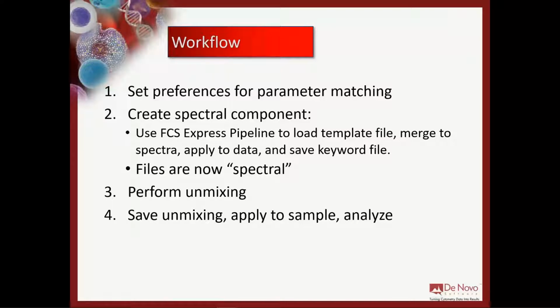Now, in FCS Express, what's the workflow? How do we actually set this up? What we've done in the latest release of FCS Express 7 is make this very easy to do, and that's what we're going to go over today. So one of the first considerations is setting preferences for parameter matching. I'm going to show you where to do that, how to do that, and why.